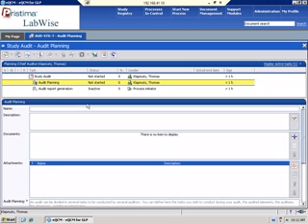Study audit for 4 or 5 different components of a study. Now, the focus of today is going to be on a preclinical study, but with this auditing, you can use it for auditing any type of process. It doesn't necessarily have to be a GLP preclinical audit. It can be auditing training records, financial records, any type of audit that you need. And so I just want to make sure that everybody's aware of that.